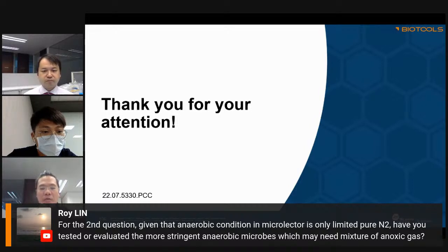For the mixture, if you're using CO2 upregulation or downregulation, you are actually mixing the gas from the atmosphere, that is from the environment, with the CO2, in order to achieve a specific concentration, and similarly for oxygen downregulation. So those are the gases we can use at this point: nitrogen, CO2, oxygen, and the air from the environment.